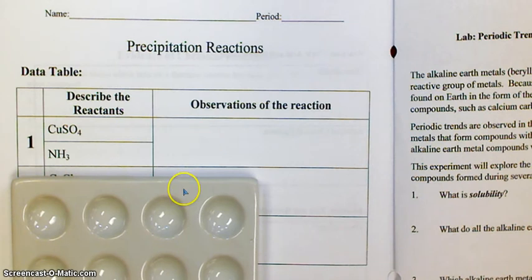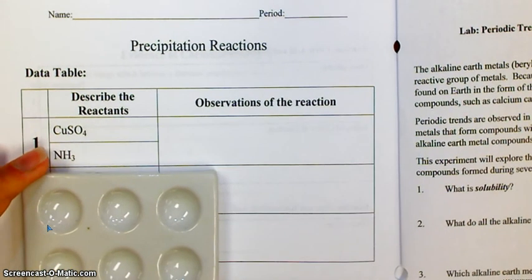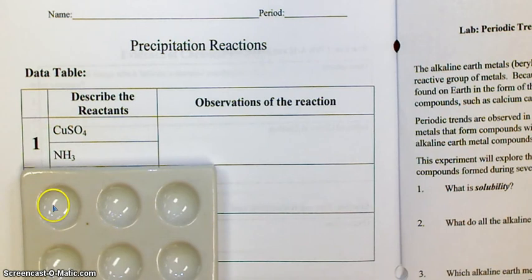So what I'm going to do is I'm going to put copper sulfate right here. Actually, I think I'm going to turn it this way. Okay. So I'll put copper sulfate just by itself here, ammonia here, which is the NH3, and then in the third well will be the 2 of them together so that they get a reaction. Okay, you can see right here that the copper sulfate solution is a light blue solution. It's kind of hard to see on a white spot plate, but the ammonia water is a clear solution.